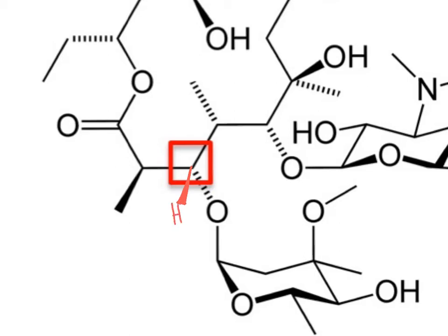And thinking about the HMBC and COSY correlations, we'll start with the COSY correlations. So at this position, looking for the protons that are vicinal, there would be a proton here that is vicinal. Also over here, there would be a vicinal proton as well. And so we would expect to see correlations to both of those. So I'm going to draw the double-headed arrow here in red to illustrate that correlation. Another double-headed arrow coming over to here. And I'll actually go this way just to make things a little clearer. So we come over to here. And these would represent our correlations to the vicinal protons.